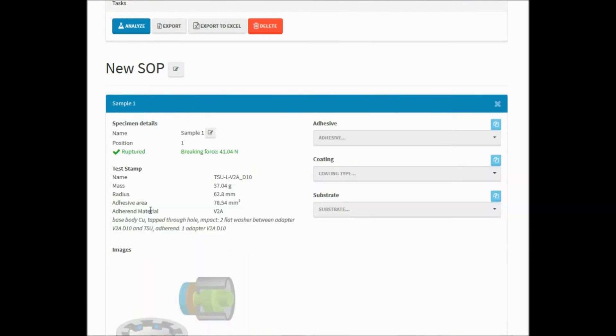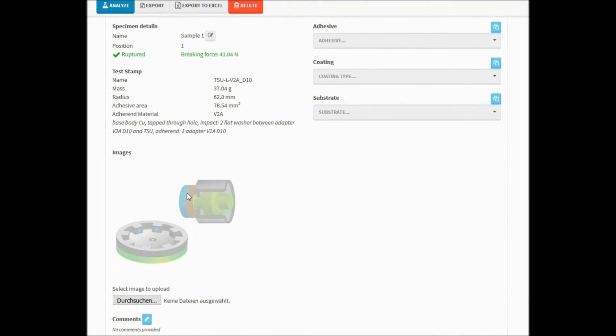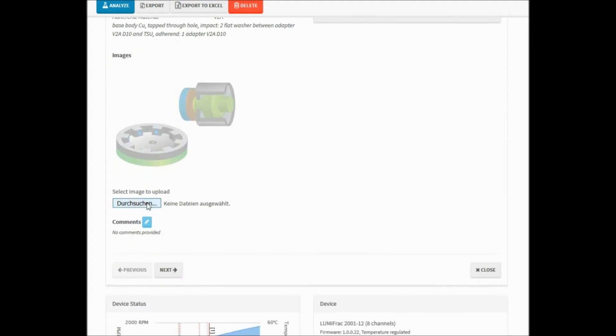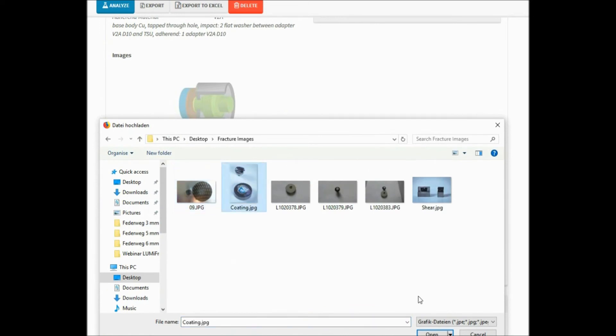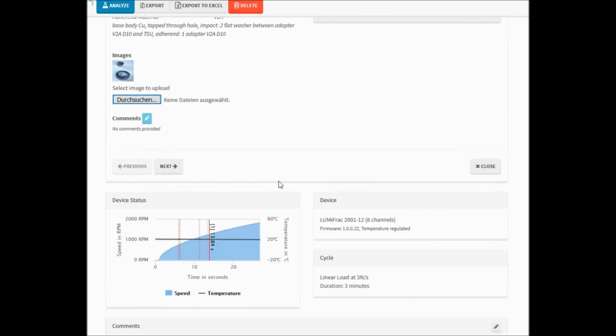Here we click in the detailed view for our sample one. Again, we have options for every single sample, like Excel export and a re-watch of the recorded analyses. Another interesting feature is the image upload, where you can make a picture of your ruptured specimen and assign it to the specific sample.